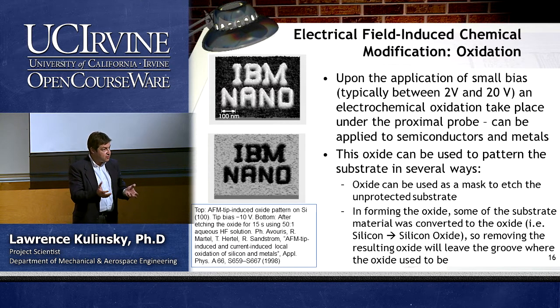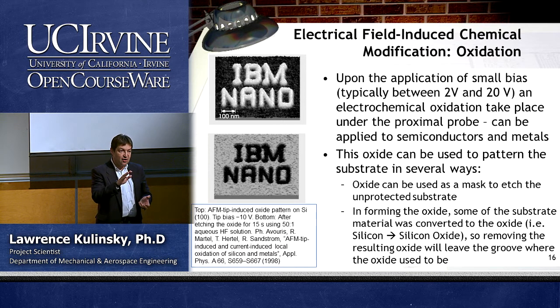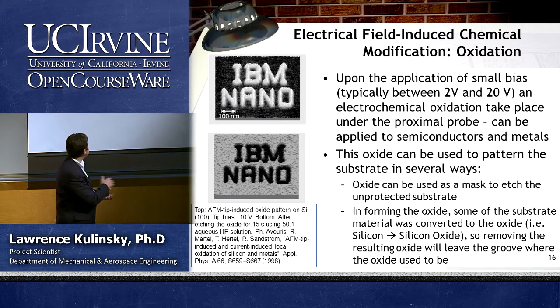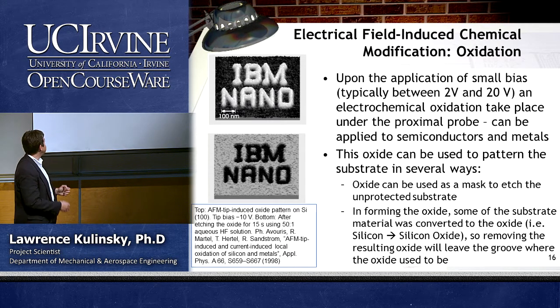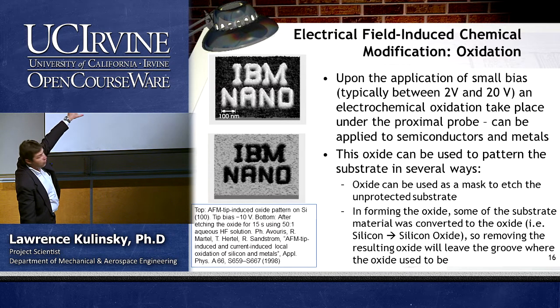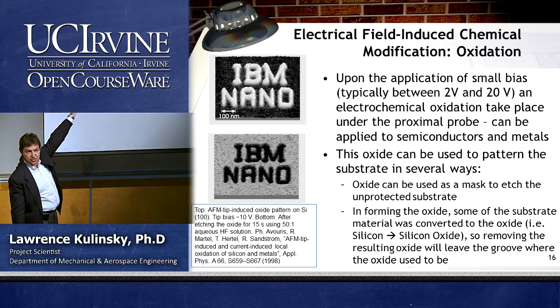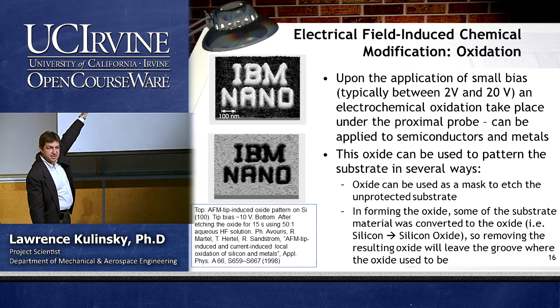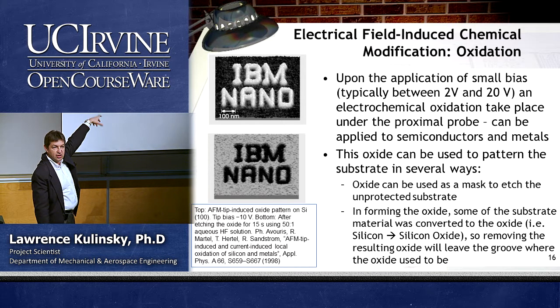We took it from the surface and we produce oxide. So when we etch out the oxide, what's left behind are the grooves, okay? Where silicon used to be, and we convert it to silicon dioxide. We remove the silicon dioxide, and now you have letters, okay? So as you can see, you have the C bar there. The width of that bar is 100 nanometers. We have about 30 nanometers, maybe, thickness of each letter.